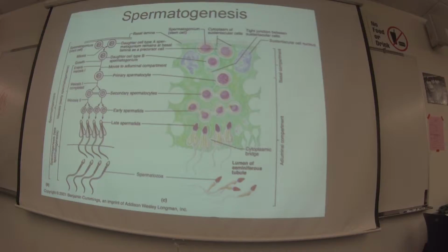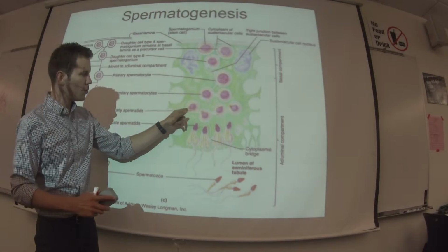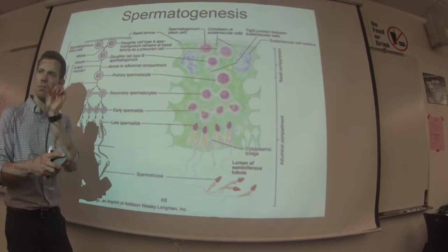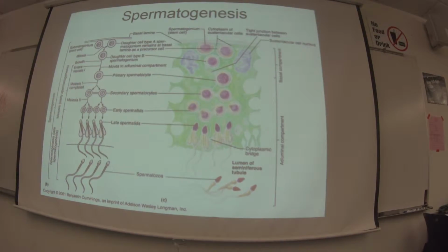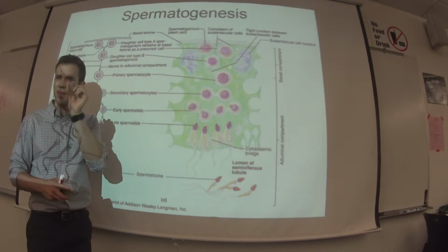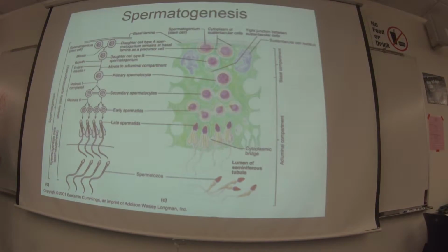They're pretty easy because the round nucleus that you see in all of these cells gets smushed down into this bullet shape, like a really sharp bullet. And that's really what's called the head of the sperm that's being formed. And so you'll see this totally different shape. It's a really dense, dark little nucleus. And that's how you'll know it's a spermatid.